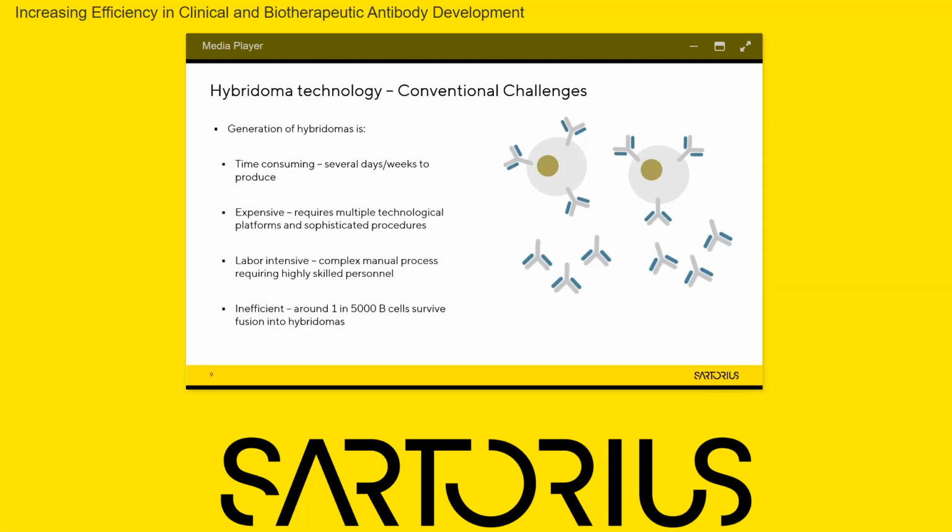It's expensive as well. It requires multiple technological platforms and sophisticated procedures in order to successfully produce a fusion between a B cell and a myeloma cell. It's labor intensive. It's a very complex manual process and it requires highly skilled personnel, and it's highly inefficient. So for 5,000 B cells that you try to adapt into hybridomas, about one of those will survive the fusion and become a fully fledged hybridoma that produces the antibodies that you're looking for.